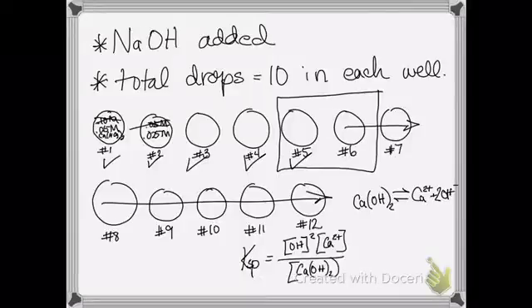So there's technically, oops, sorry, bracket there. There's technically what your expression is. So at this point, you would have to plug in some of those values to try to figure out which was the last well plate that you had a precipitate and the last well plate that you did not have a precipitate.